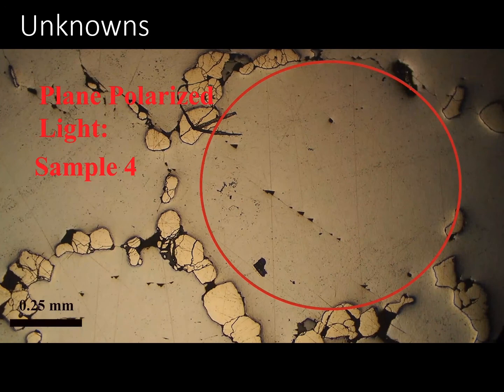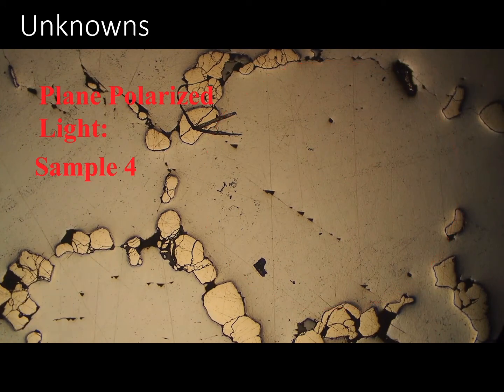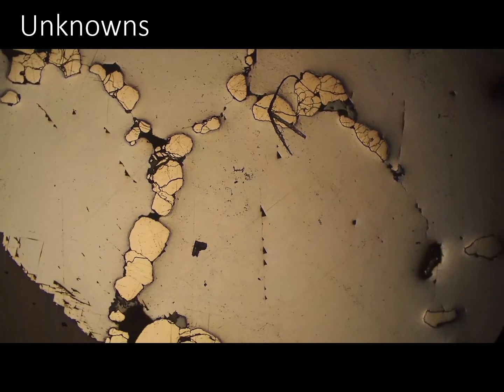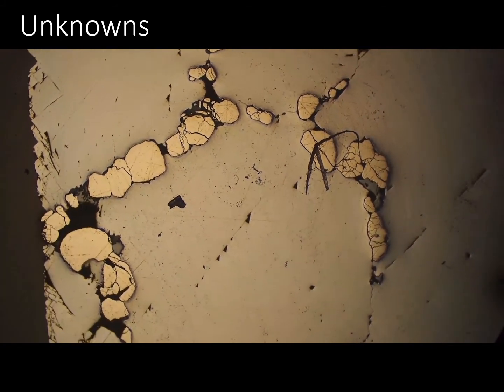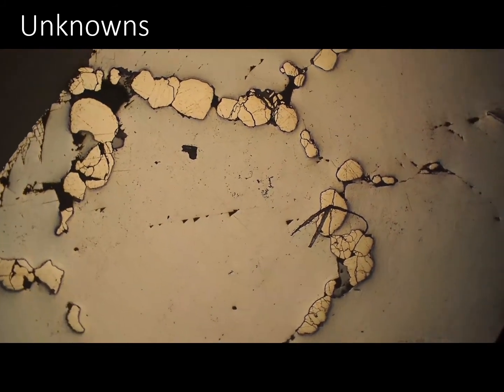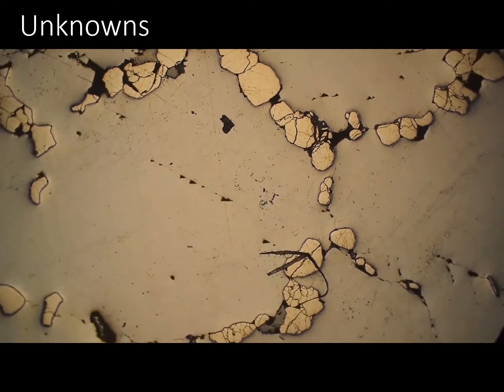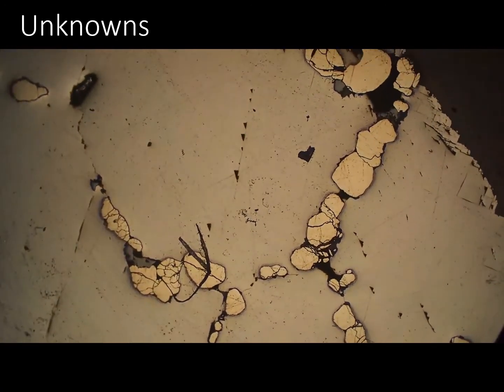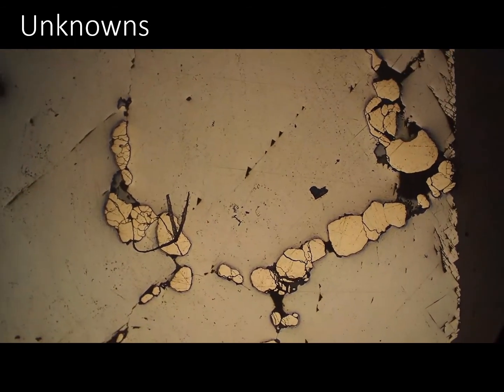And here we are, plane polarized light on sample 4. And here we are in cross polarized light on sample 4.